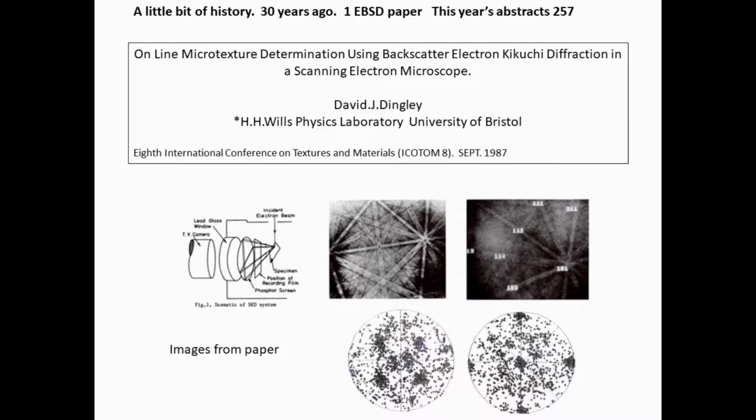And that is the title page of the paper given 30 years ago at Los Alamos. It was called electron Kikuchi diffraction then. There was still discussion about what the technique should be called. And below it is a reproduction of some of the pictures that were shown there, the images. The EBSD images we got then weren't that high quality.